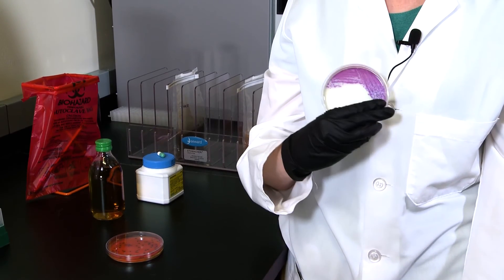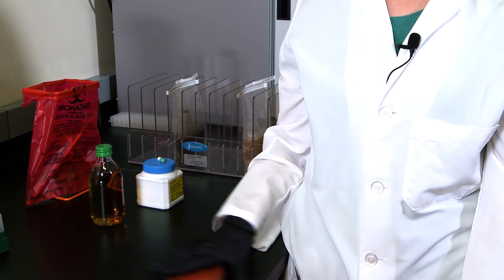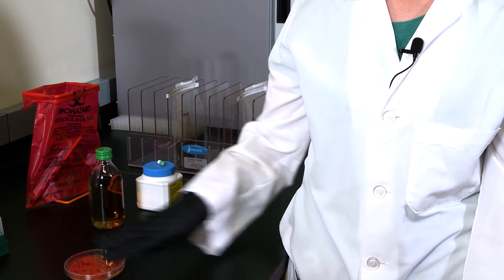So we can see typical salmonella colonies in magenta and here on the rapid L mono plate we can see the typical blue colonies of listeria monocytogenes. Bio-Rad's rapid chromogenic media are easy to read aren't they?